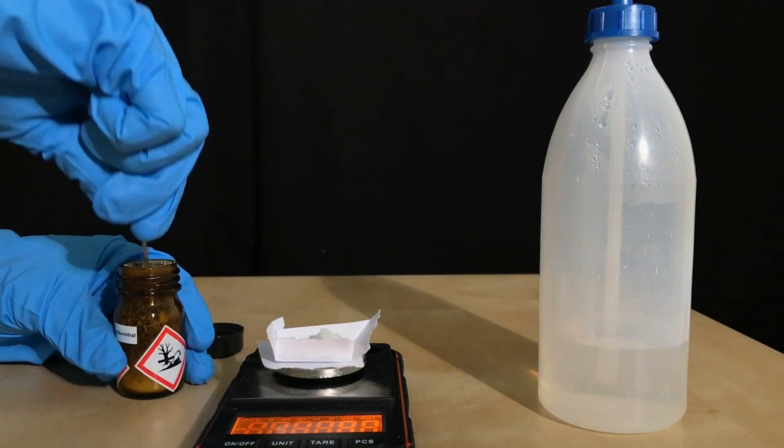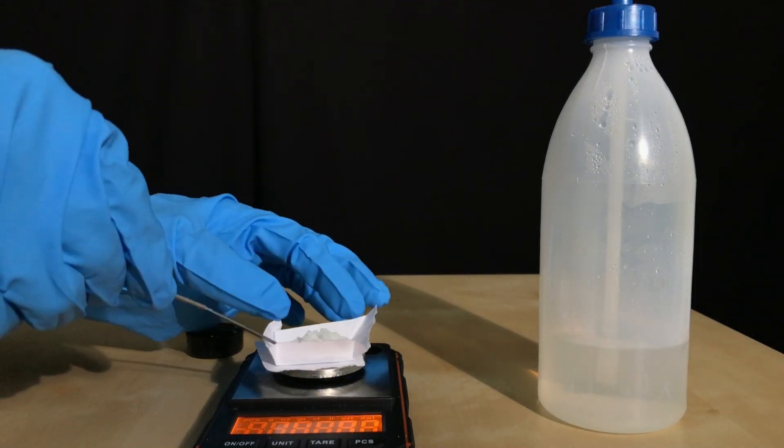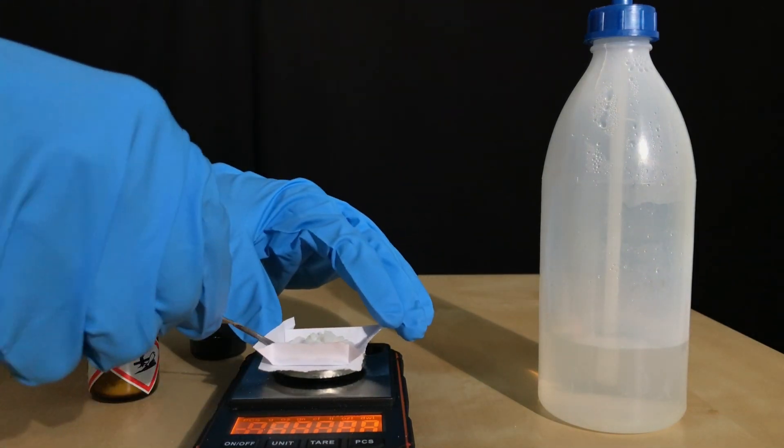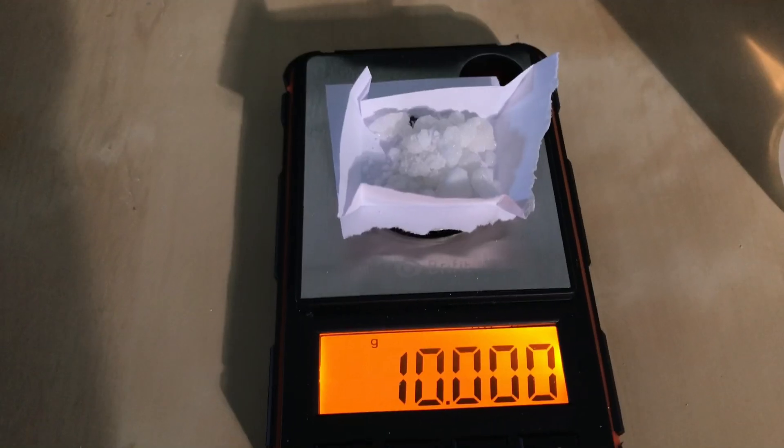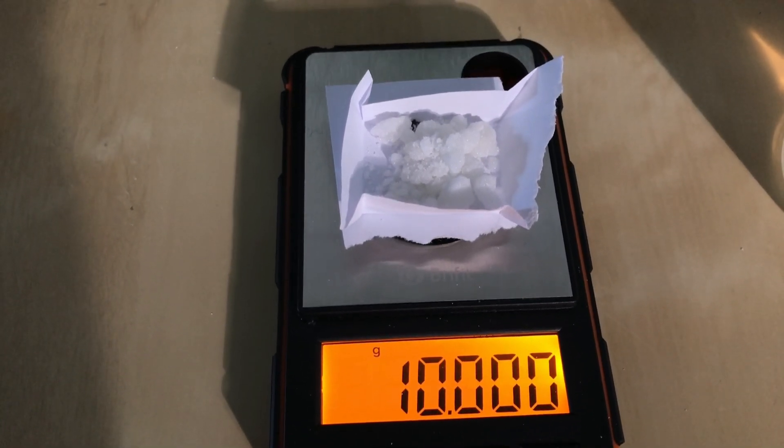To weigh out the reagents, I'm using a very accurate scale because I don't want to waste more silver nitrate than I actually intend to. We weighed out exactly 10 grams of silver nitrate. As you can see, silver nitrate is this beautiful white crystalline solid.